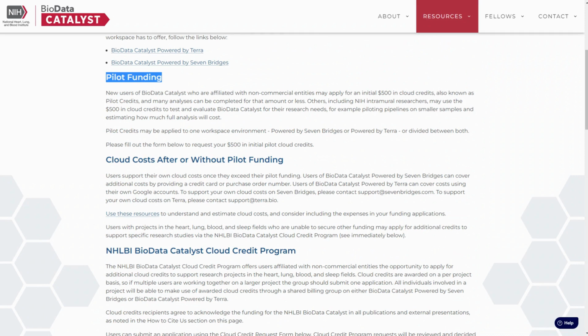Now, when you make a user ID on 7bridges, you have this billing group for pilot credits. More on this later in the billing group video, but it's not populated with any cloud funding. You first have to request it from NHLBI. So this $500 can be used to learn the platform and do some initial testing before you decide to scale up your research on the cloud.